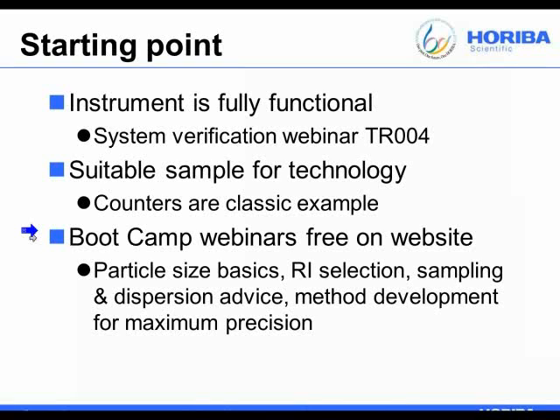And the other thing I'll say too is a lot of the questions that came in the pre-webinar registration dealt with more usability and particle size training ideas. And we cover a lot of those in our 6-part bootcamp webinar series. That webinar series is really focused on laser diffraction, but there are plenty of presentations, the particle size basics presentation, the sampling and dispersion, and the method development presentations, that are very general.